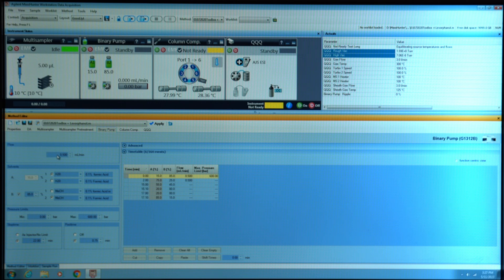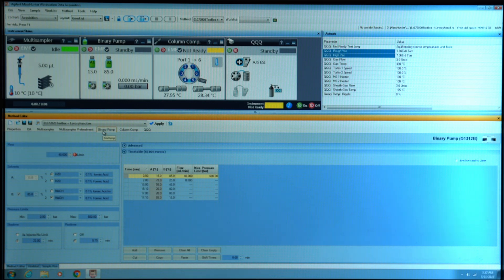The first thing to do is increase the flow rate to either four or five mils a minute, then click apply.